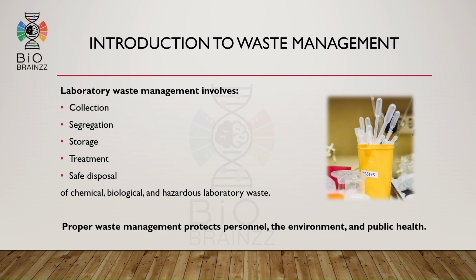Laboratory waste management involves several important steps such as collection, segregation, storage, treatment, and safe disposal of waste materials. Laboratories generate chemical, biological, and hazardous waste during routine work. Proper waste management protects laboratory personnel, public health, and the environment from harmful exposure and contamination.